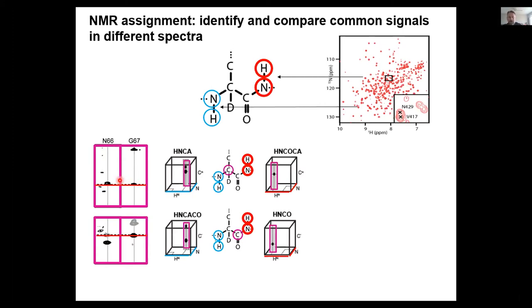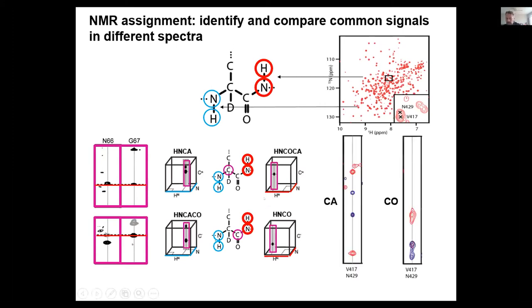Most likely because, of course, you have many residues in the proteins and all of them will happen to have the same C alpha. So you repeat the procedure with another carbon, like a carbonyl carbon here, or the C beta carbon, all right? That's a lot of work. And in fact, it all relies on the user, before doing that analysis, picking all those signals completely the right way. And very often when we work with large proteins, and in our labs we're really interested in studying enzymatic systems, and we don't want to take no for an answer if the protein is large and we have crowded spectra. So very often we encounter a situation like this, which adds a couple of days just for assigning one single part, because when you have two residues that overlap in the HN dimension, you have to pair then the carbons here in the right way. Otherwise, you're not going to get the right solution.